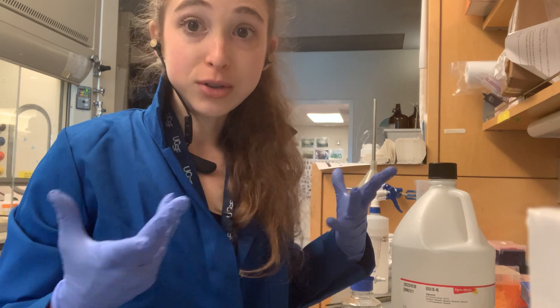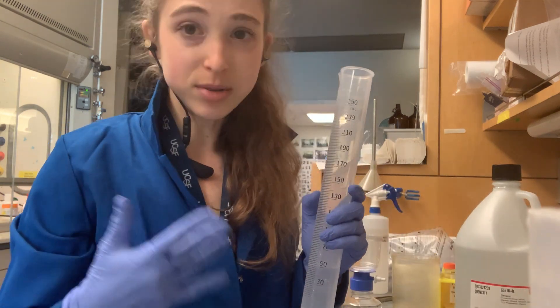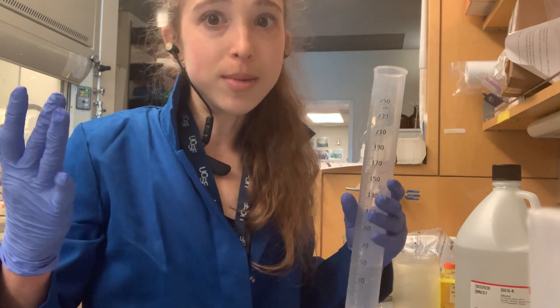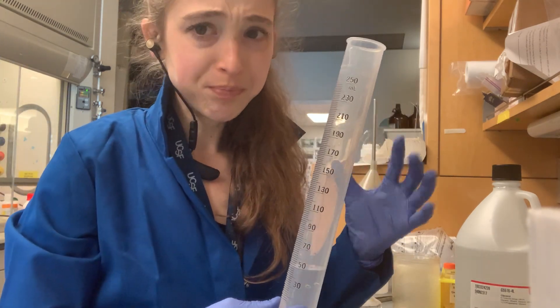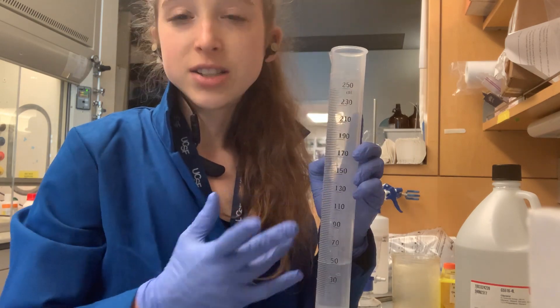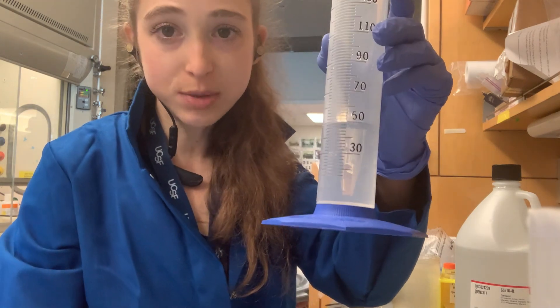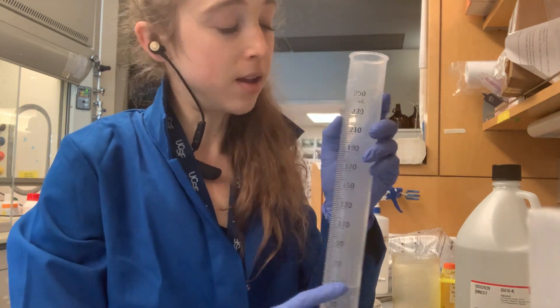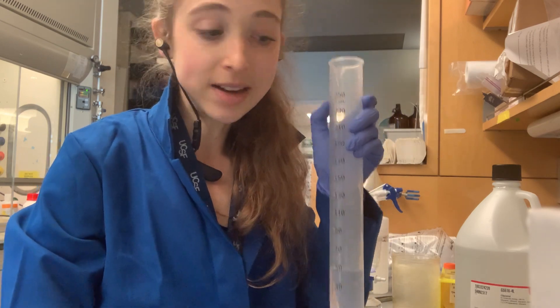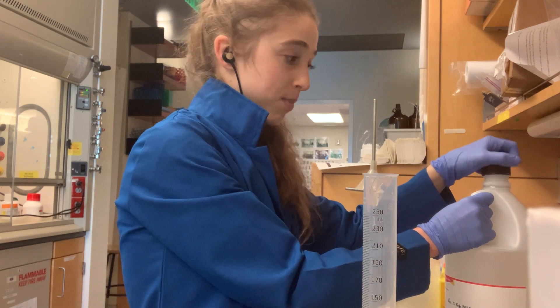You don't even have to pipette for this. To make an 80% solution, you add 80 per 100 ml — so I'm making 250 ml total, which means 200 ml of glycerol and 50 ml of water. What I did is put the water into my beaker up to the 50 ml mark, and now I'm going to add glycerol.